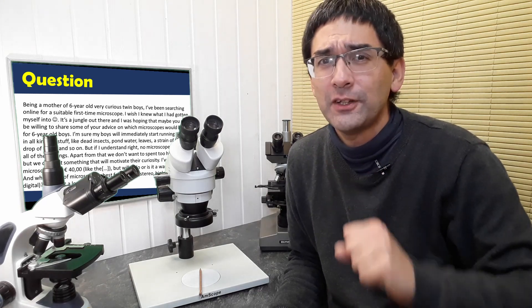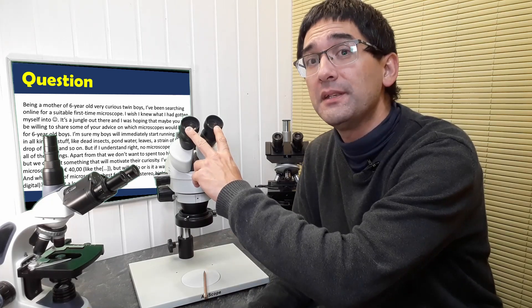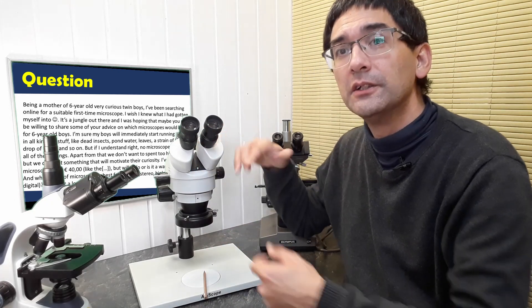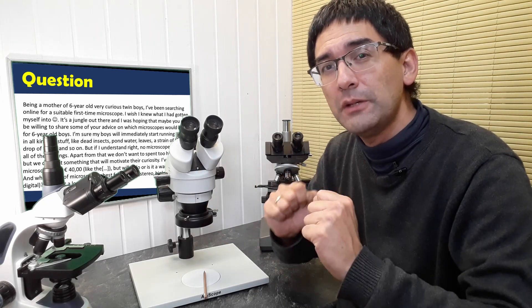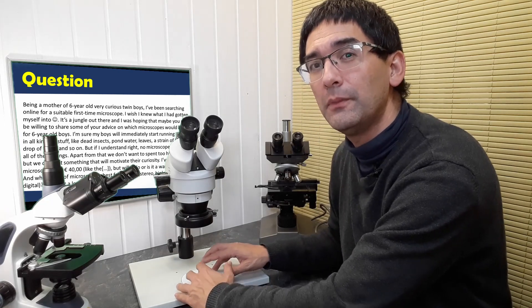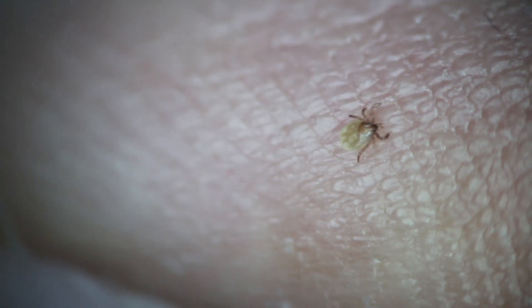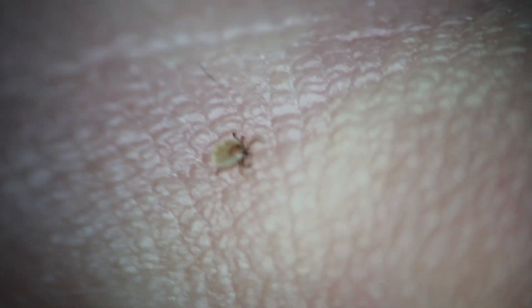And another advantage of stereo microscopes is that you actually, the children get an upright image. So this means the way I put the object in under the microscope, this is the same orientation that you're going to see it using the eyepieces. The reason is, is because there are prisms in here that turn the image upright again. Why is this important? Because this actually means that when you are actually manipulating the specimen, when you're moving it around, you're actually seeing that, you can actually manipulate the specimens. You don't have to think around that the whole thing is actually upside down. Because it's not.